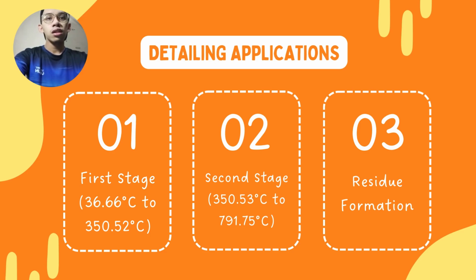And the last one, residue formation. The final residue at temperatures above 791.75 Celsius is 0.34% of the initial weight, indicating the presence of inorganic and non-volatile components that withstand higher temperatures.